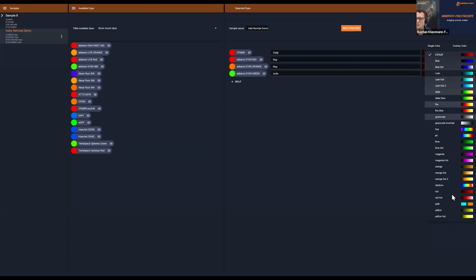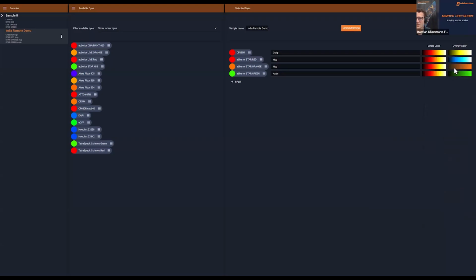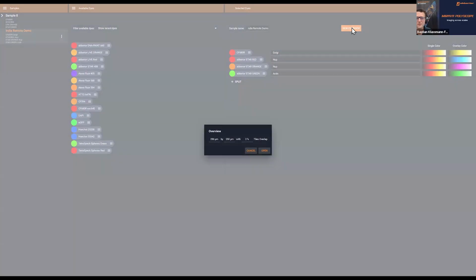And then I can also choose overlay colors, which change the color map as soon as I overlay the different channels. Then I can go here, for example, for something for colorblind people. And here we have our actin channel. However, in the Lightbox, everything starts with an overview.